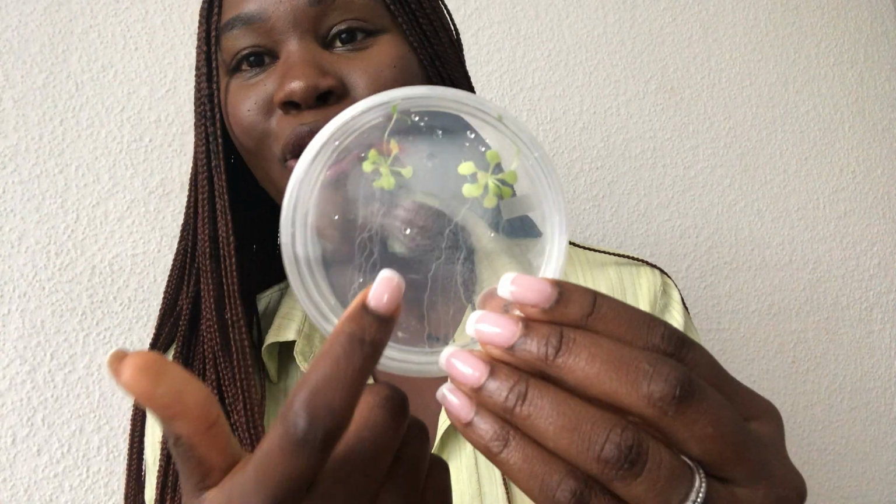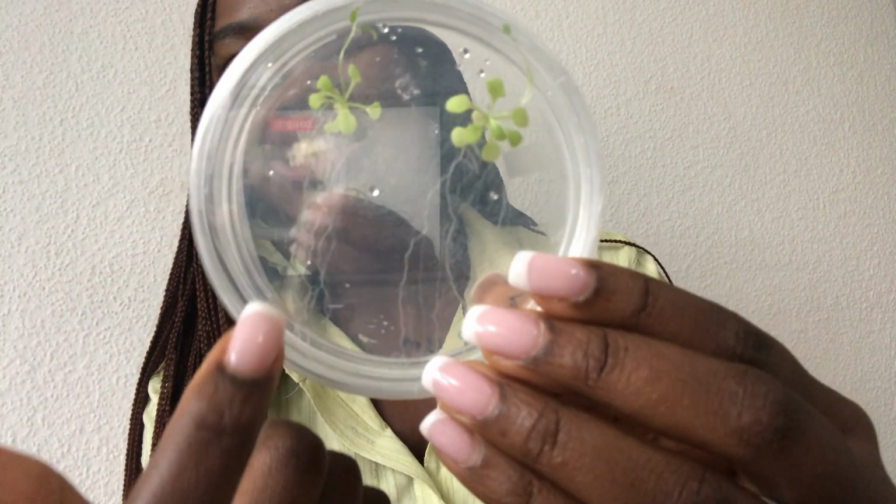And the transparency of this root, for example, makes it very, very important for us to see through the petri dish, through the media, and through the root to actually see the stylet of the nematode. So this could only be limited to nematode research, but it's really, really important.